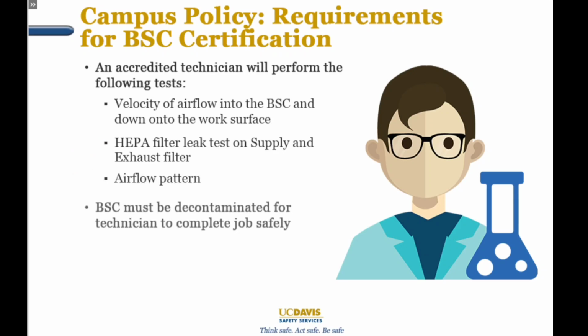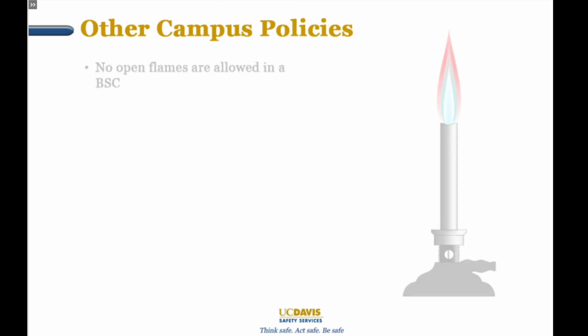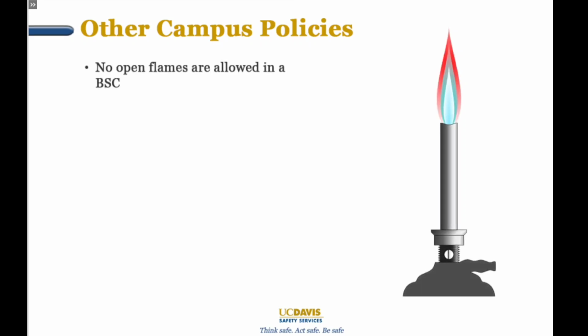It is important to remember that the BSC must be decontaminated in order for the technician to complete their job safely. The method of decontamination depends on the risk of the biohazardous materials that have been used in the BSC. Other campus policies are: no open flames may be used in a BSC.